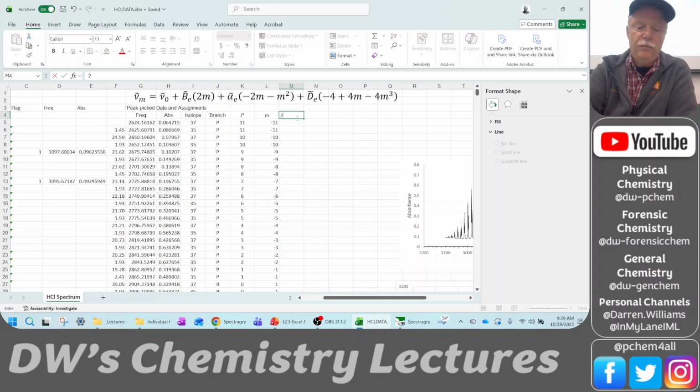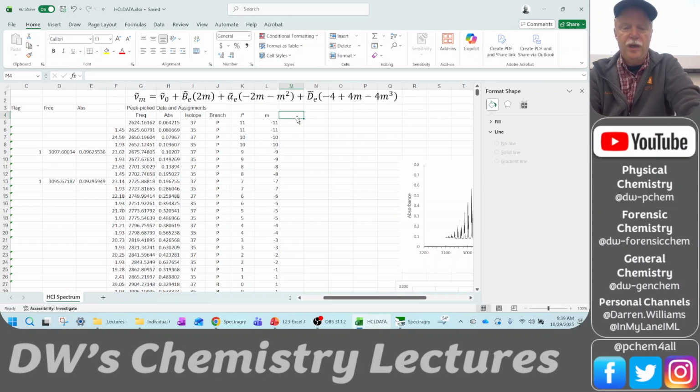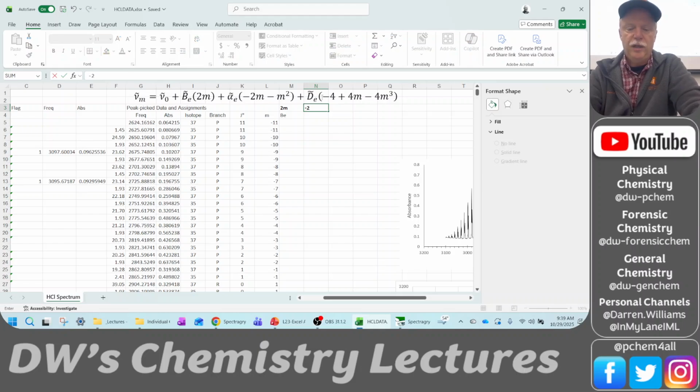So this is a 2M column. Let me put the formula up above, like 2M. And right here I'm going to say BE, because that's the BE column. Does everybody agree with that? Okay. Then this one I'm going to do minus 2M minus M squared. Oh, I did N, sorry. Minus M squared.